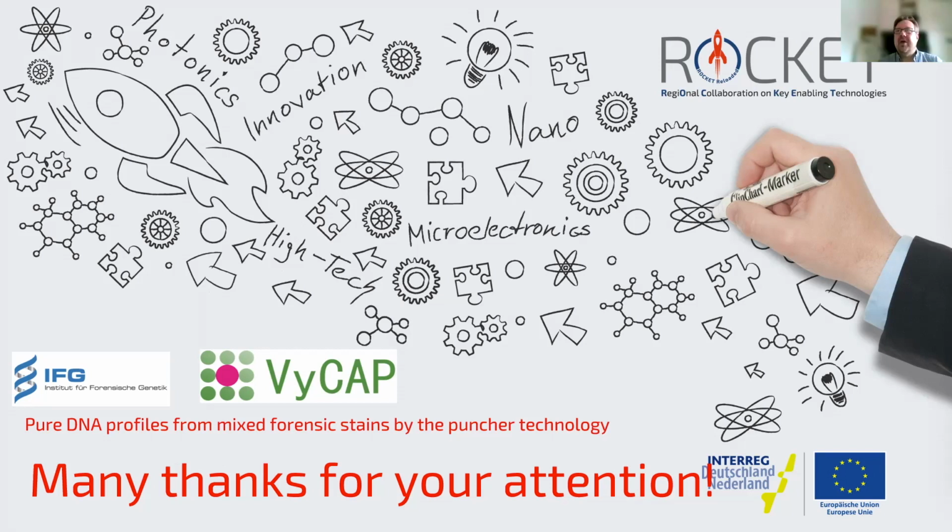Yes, in forensics, you have to do a manufacturer validation to show that they are fit for purpose. And then in addition, the laboratory that has bought such a machine must do an additional validation step, to demonstrate that they are capable of using this machine properly. So there are several steps to make it well accepted in the jurisdiction process. Okay, but the validation of the users in the end, I think you can help with this, can't you? Yes. Okay.